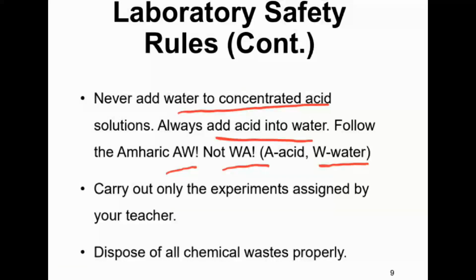And remember, you should always carry out experiments assigned by your teacher. በአስተማሪው የተመደቡትን ሙከራዎች ብቻ ነው መስራት ያለባችሁ ማለት ነው። And dispose all chemical wastes properly, so this is also very important. ሁል ጊዜ የኬሚካል ቆሻሻዎች በትክክል ማስወገድ አለባችሁ ማለት ነው። So these are the laboratory safety rules, and you should always practice these safety rules while you are working in the lab.